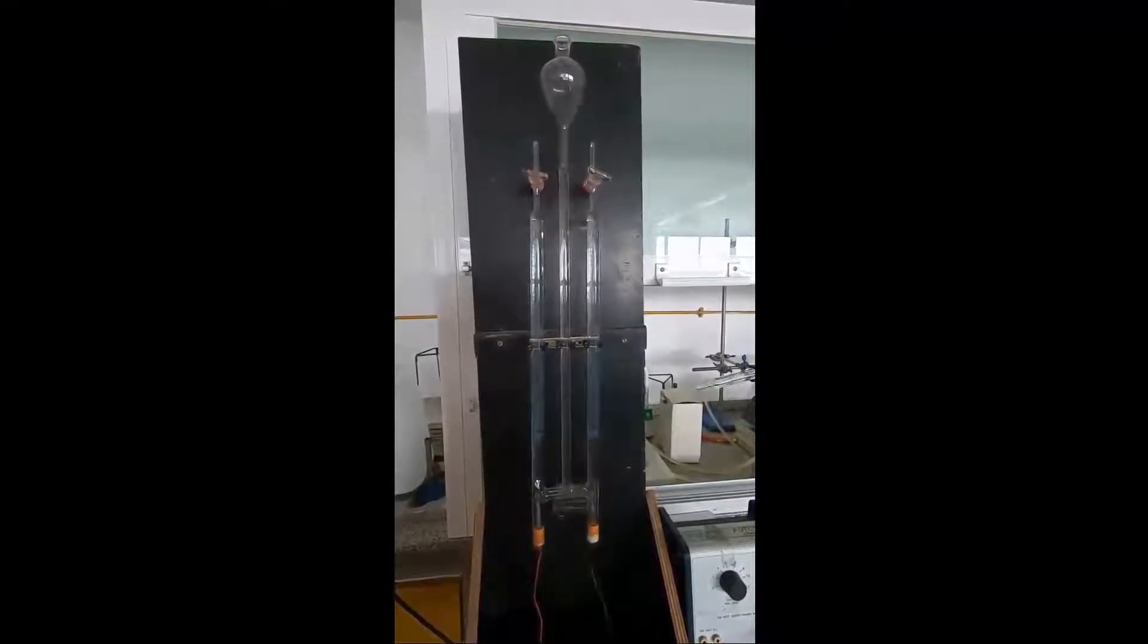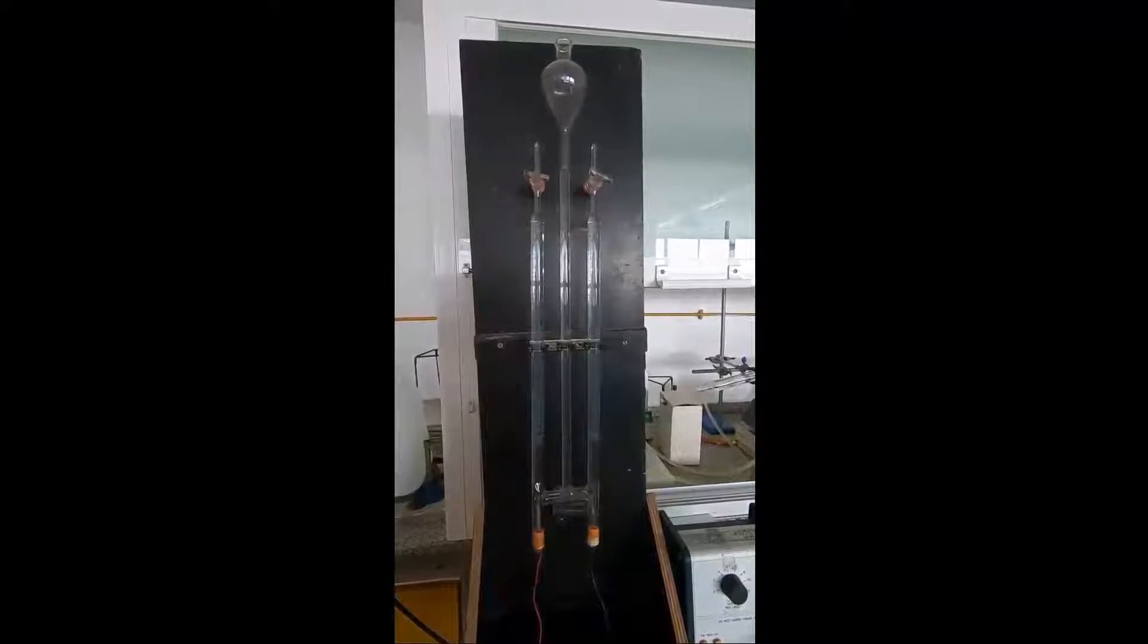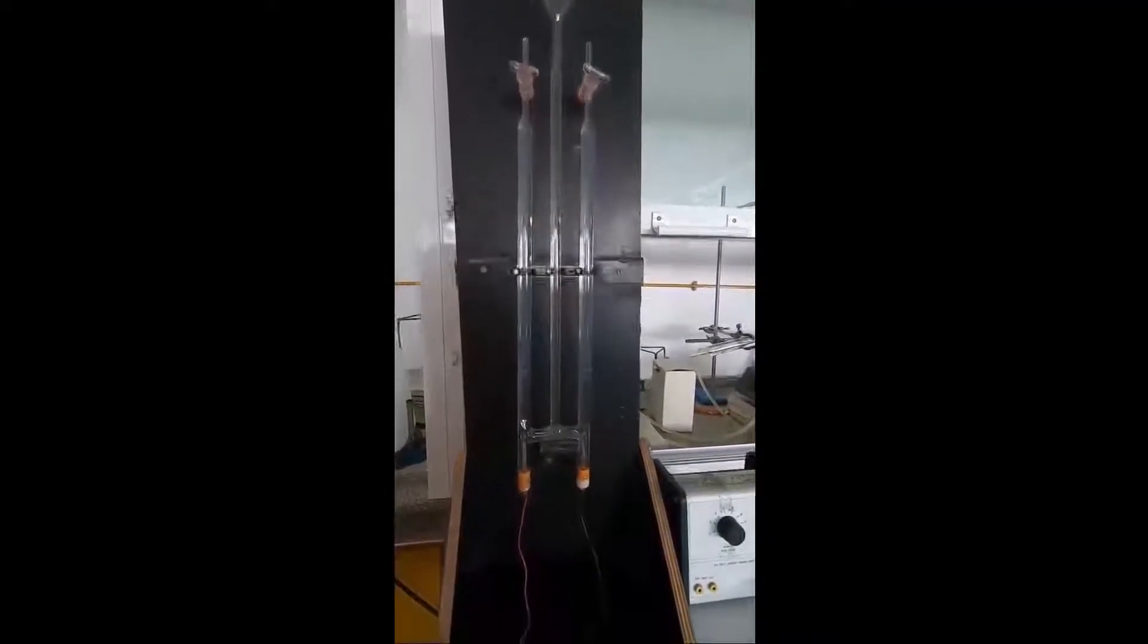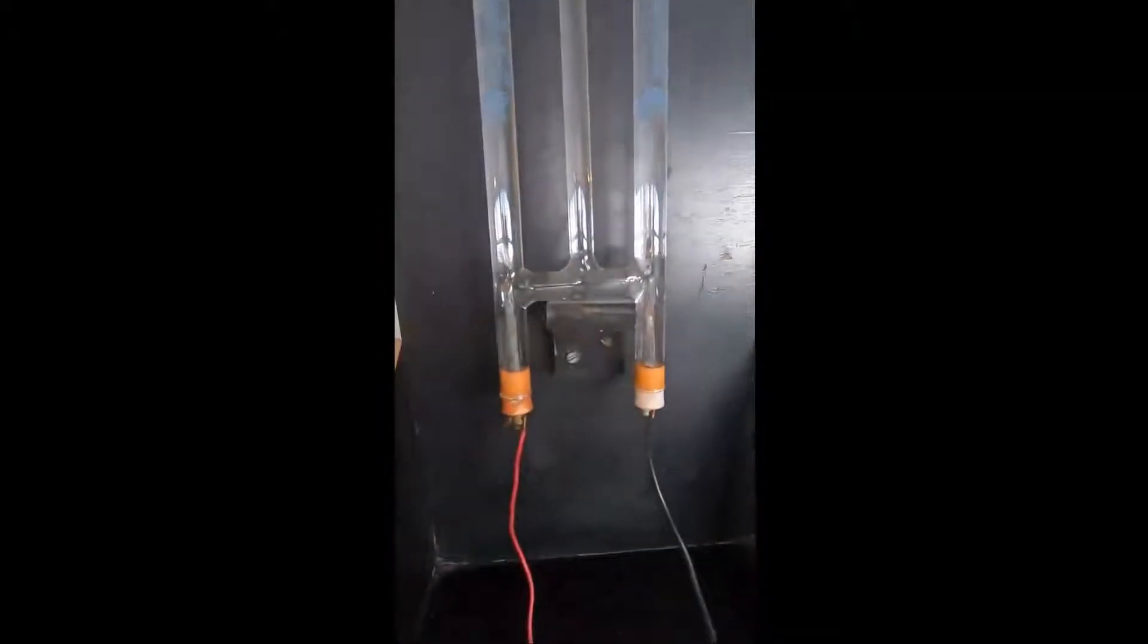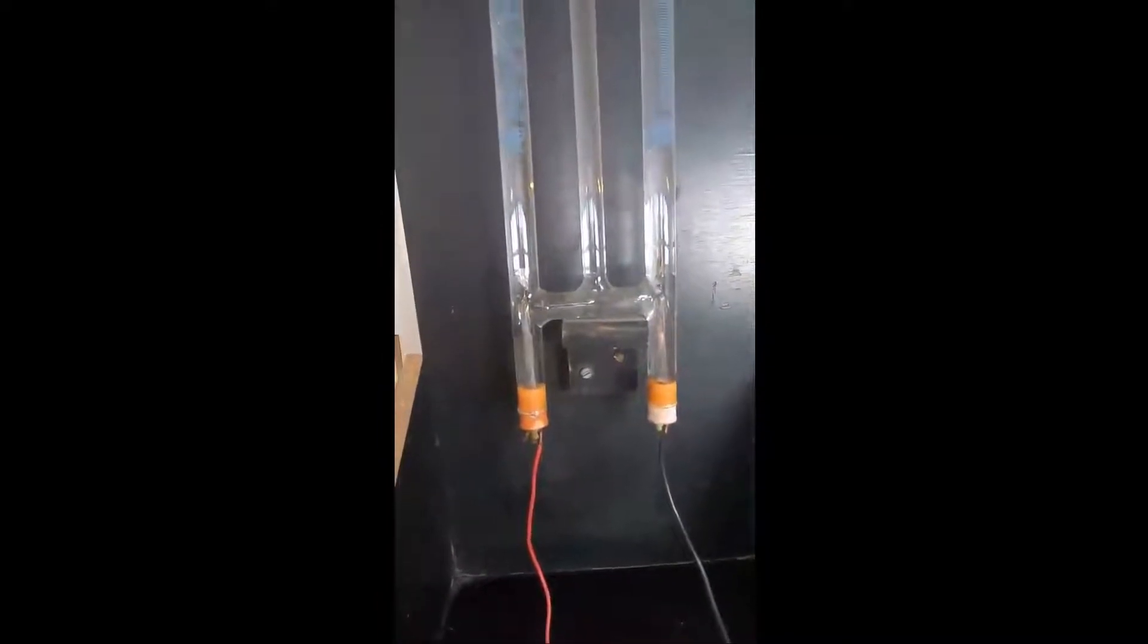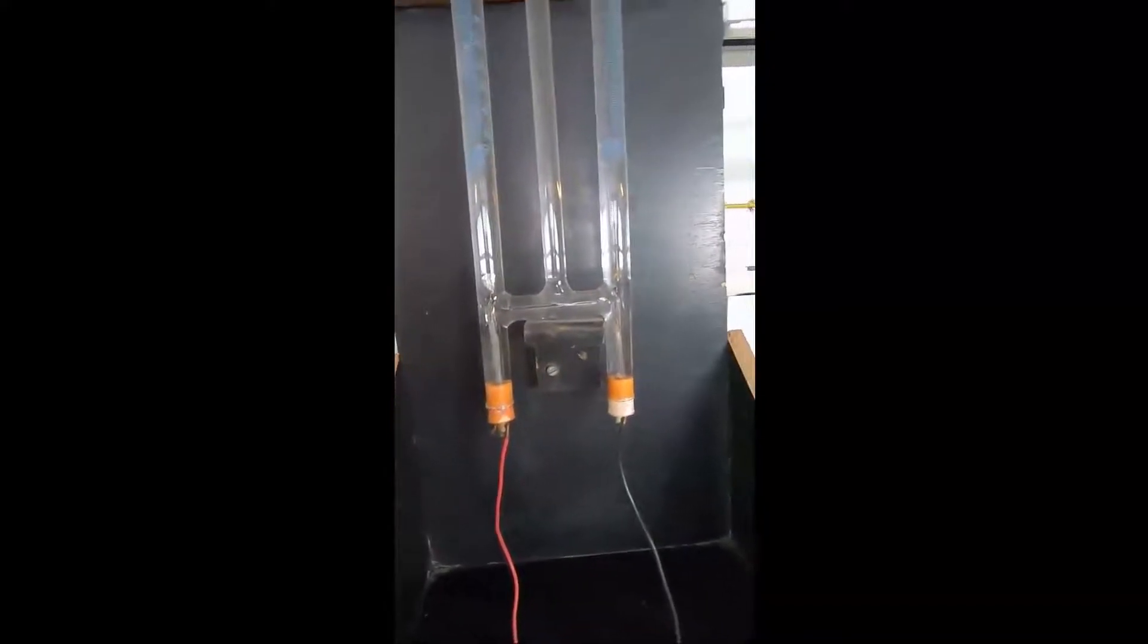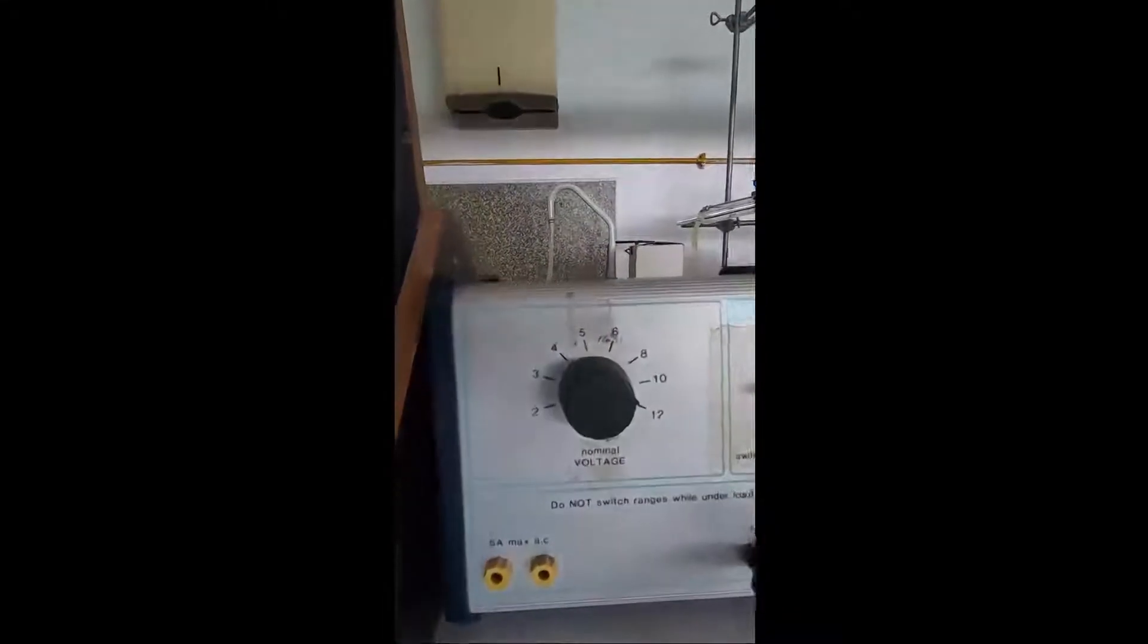This is the Hoffman voltameter. It's used to pass electricity through water. Down at the bottom we have two electrodes: a positive, which we'll make red, and a negative, which we'll make black. We're going to connect that to the low voltage supply over here. We can vary the voltage; we need to actually use quite a high voltage—we can use 12 volts.